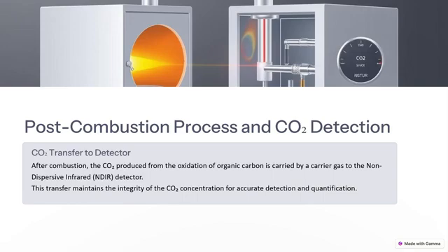And the technical design is with transfer lines that are maintained at elevated temperatures to prevent condensation of CO2, which could otherwise distort results. So this step ensures the integrity of the CO2 signal as it enters the detector.